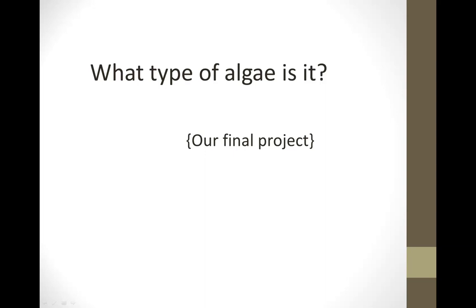Okay, so this video is going to be about the last project of the semester, and this project will take us from this week all the way through the end of the semester. It's built around trying to identify an unknown algae. Now, this project is not hypothesis driven. This would be a part of a larger experiment that somebody would conduct, and I'll talk more about what that might be when we get into lab. But for now, the whole project is not hypothesis driven. That means you don't need hypotheses for your lab notebook.